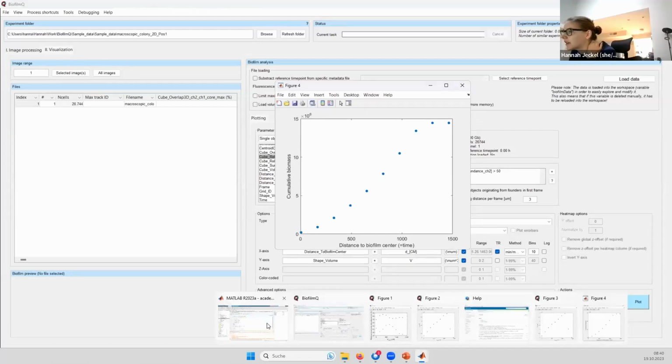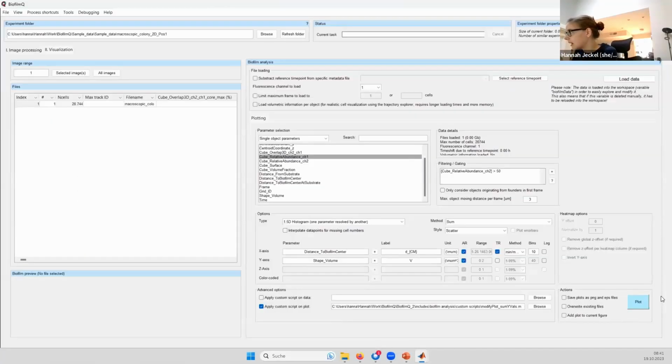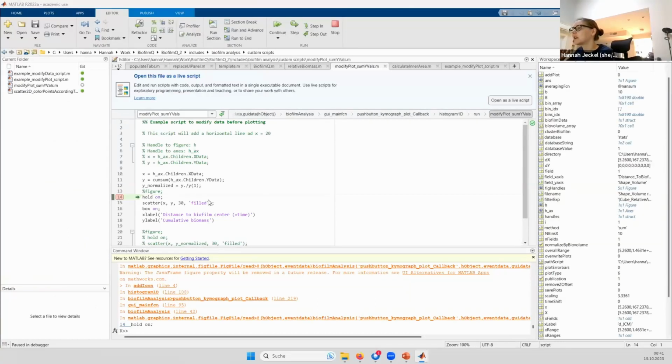So I'm going to show you another trick that is specific for MATLAB, is really useful, which is breakpoints. A lot of people that already do programming might be familiar with breakpoints, but for those who are not, breakpoints are a game changer in any kind of programming. Basically, you click on a certain line, and then when I run my command, which would be the same as before, it stops in that line. And this means that I can now modify and change things that are happening in here.